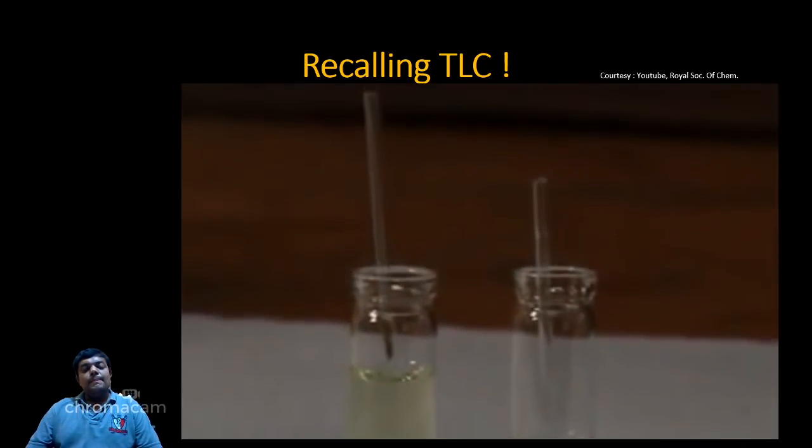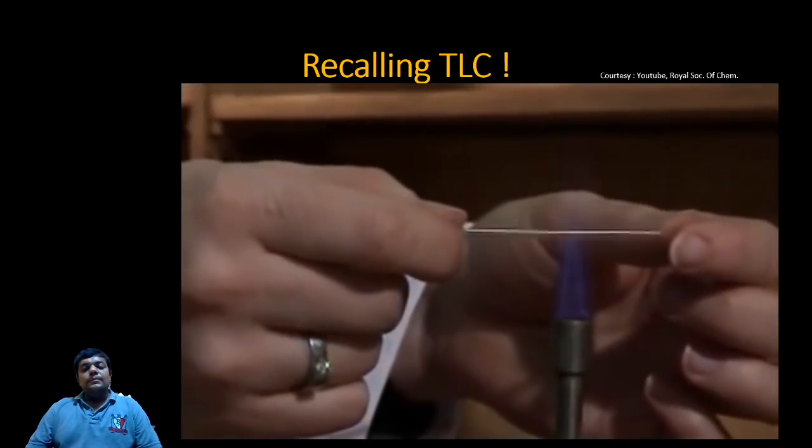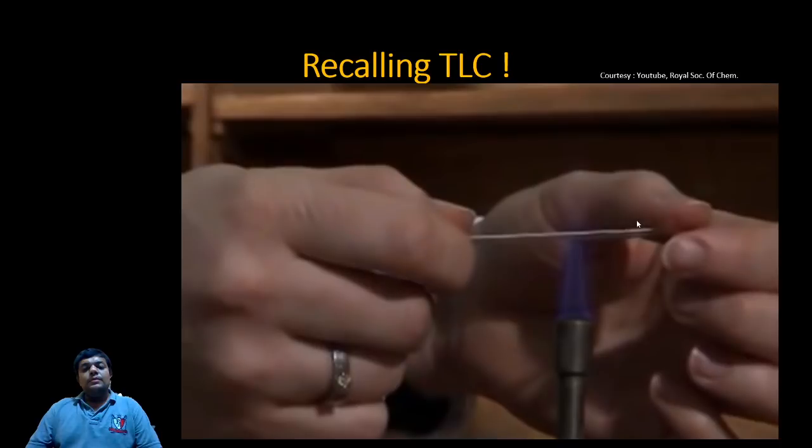First of all, we need to make a TLC spotter. Heat the centre of a capillary tube in the blue cone of a micro Bunsen burner. The capillary, which we generally use for melting point and boiling point, is being broken into two by stretching it in the flame, so it will give a nice point which can be used to make the drop of analyte on our TLC plate.